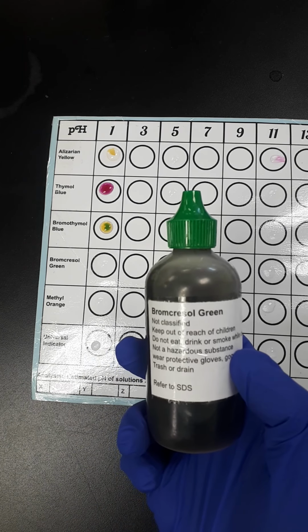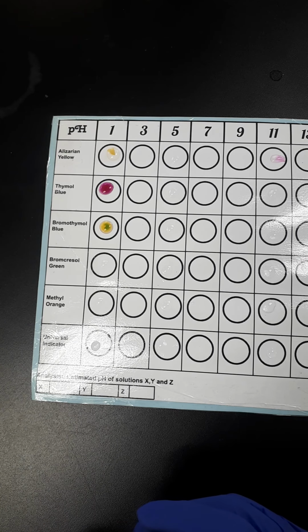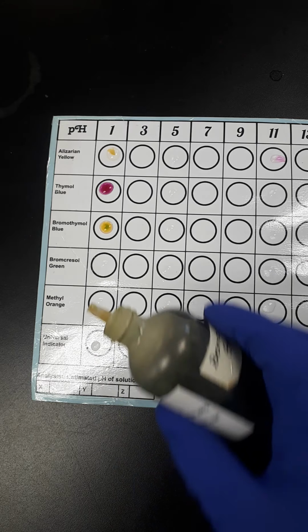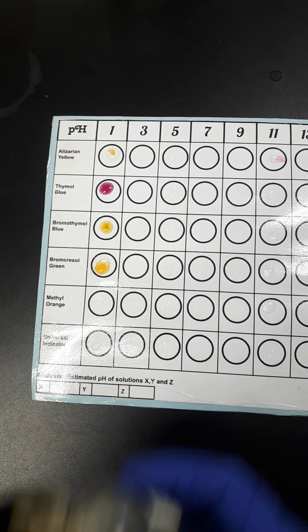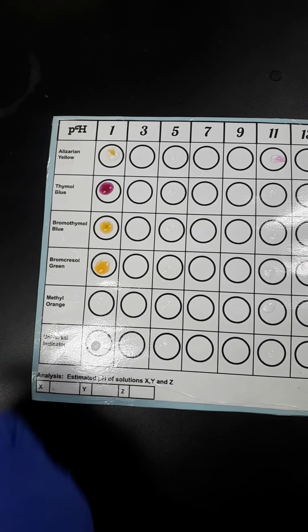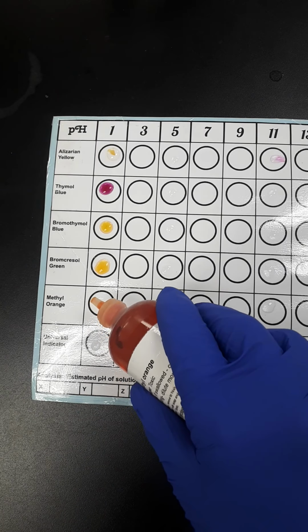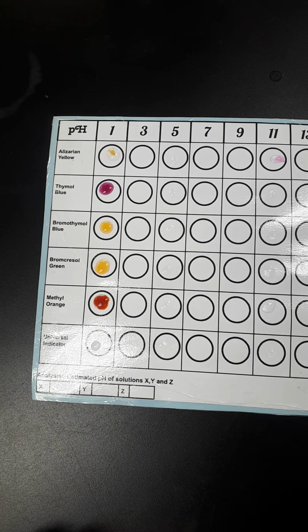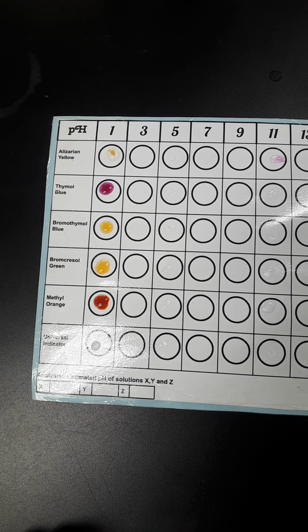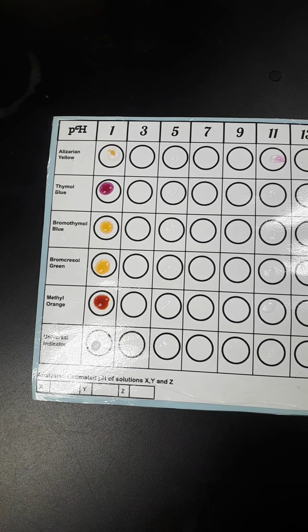What about bromocresol green? Let's try a bromocresol green. Let's make an estimate. So bromocresol green, where are you? It should be, according to our data booklets, yellow. Just double check that one. Should be yellow. Put it in. Oh, definitely yellow. And then finally, methyl orange. Let's have a look here. Methyl orange. Oh boy, methyl orange. I can't tell what color that is if I'm being totally honest with you. But it should be red, and I hope you're seeing red as well.